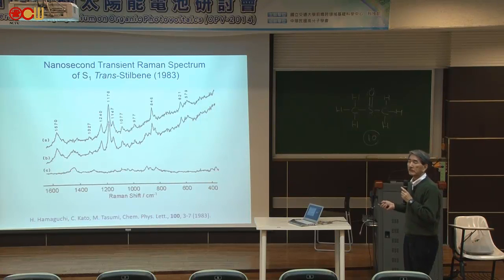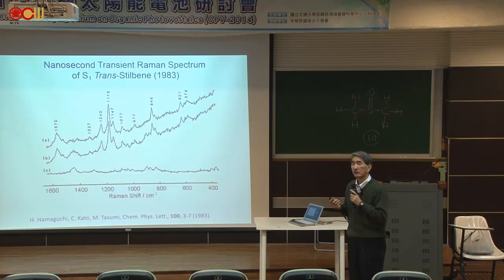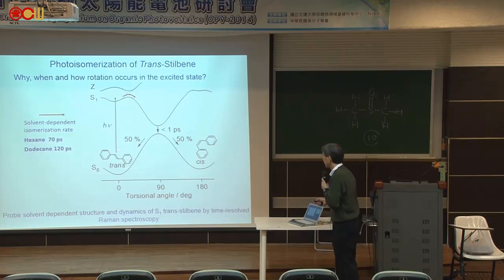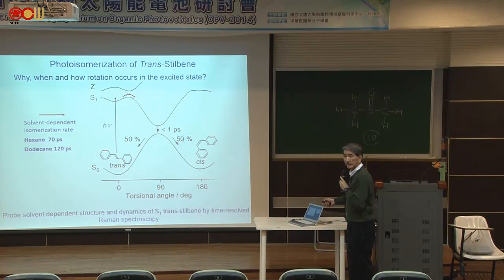So what we did was the same thing as before. We prepared a carbon-13 substituted trans-stilbene, substituting the two central carbons here.